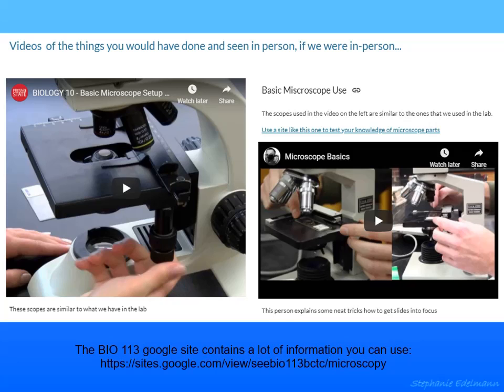One of the pieces of information that's there is two different videos for basic microscopy use. The one on the left shows scopes that are similar to the ones that we use. It's about 4 minutes long. The one on the right shown on this slide is about 12 minutes long. The scope is different, but the gentleman who explains the microscope basics has a couple of tips and tricks that are kind of cute. But you don't have to watch both of them. Just watch one of them. Watch the 4-minute one. That'll get you going.